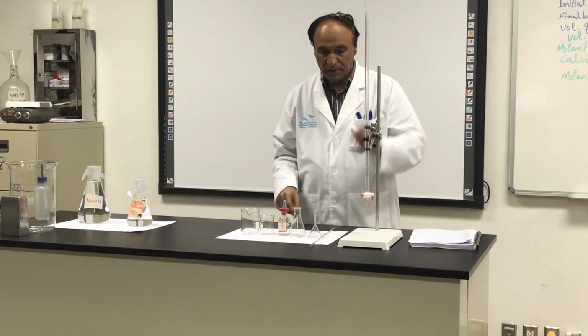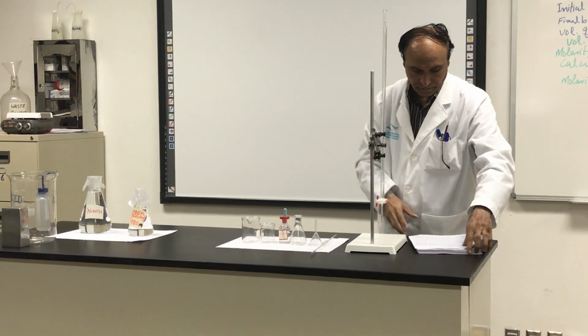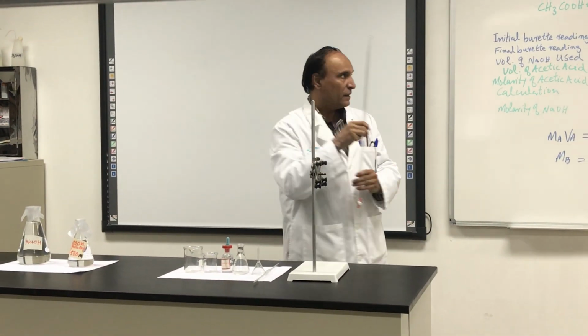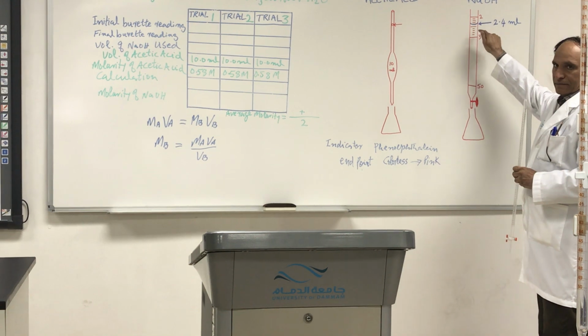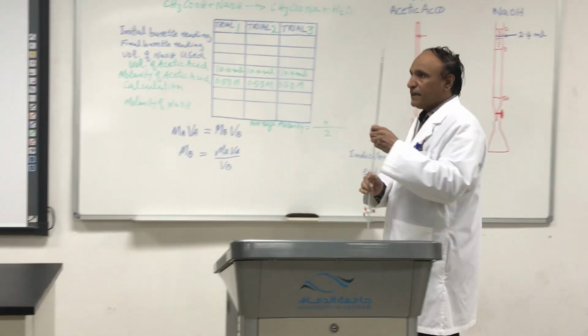I will show you how we do this experiment. This is a burette, a long tube, and there are marks. I will take the sodium hydroxide in that.